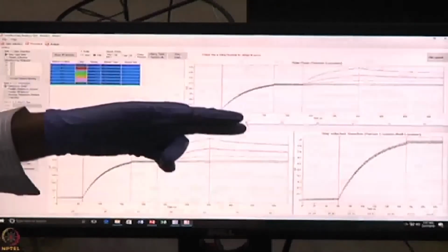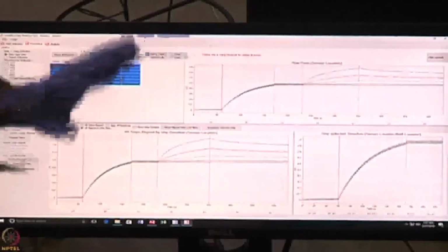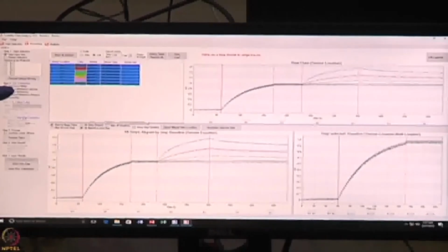So in this case, it is a very well tested molecule, and IgGs in presence of the Tween as well as the BSA will not show any non-specific binding. So that's why I went directly with that experiment. So I enabled the reference well subtraction. Then the align y-axis. What do you mean by alignment here? I will enable this, align to baseline.